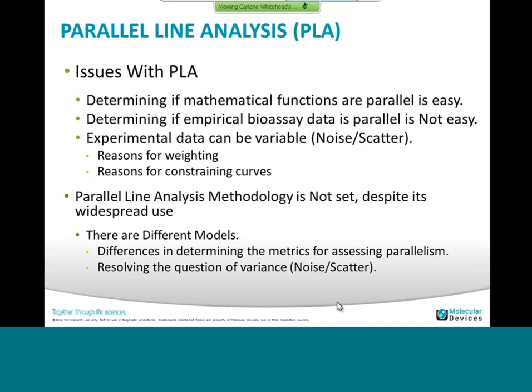The issue with PLA is that determining if mathematical functions are parallel is easy. However, determining if empirical bioassay data is parallel is not so easy. This is because experimental data can be variable. You have noise, you have scatter, and this is why sometimes you will have reason to weight or to constrain your curve. In addition, parallel analysis methodology is not set and evolves with time. People find better ways to do things, and this is implemented all the time as we go on.